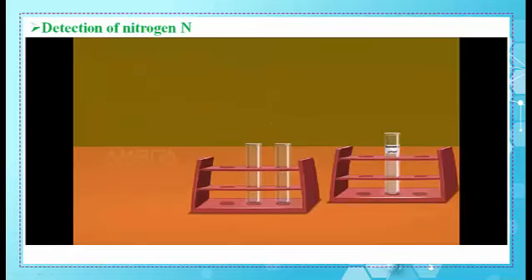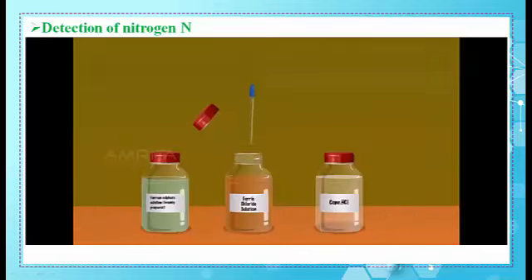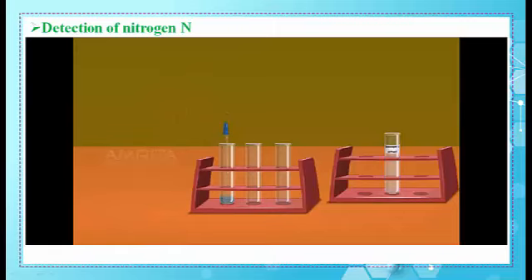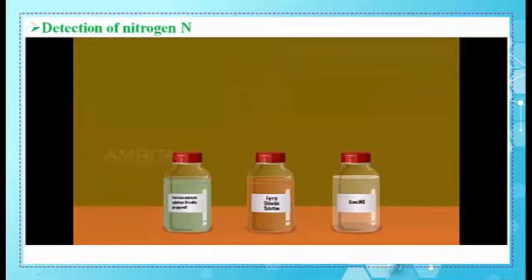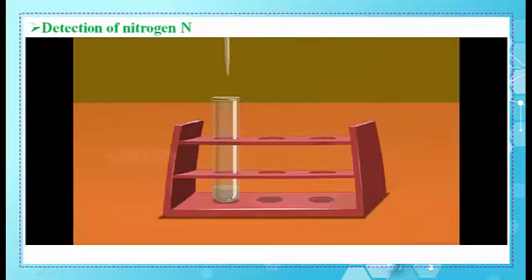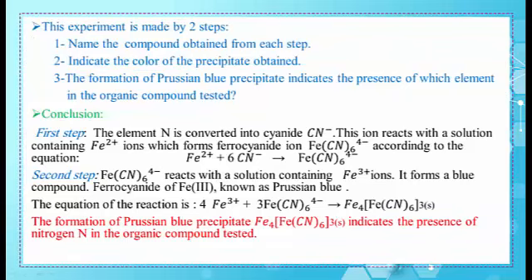Place the test tube in the test tube rack. Take a small amount of ferric chloride solution using another dropper and add it into the contents of the test tube. Using another dropper, take a small amount of concentrated hydrochloric acid and add it into the contents of the test tube. On further treating with ferric chloride and concentrated hydrochloric acid, sodium ferrocyanide forms a Prussian blue complex — ferric ferrocyanide. As seen in the video, this experiment is done in two steps: in the first step we added Fe²⁺ ions, and in the second step we added Fe³⁺ ions.